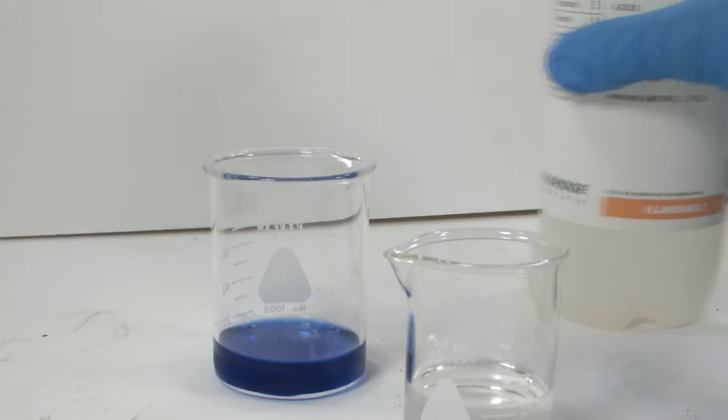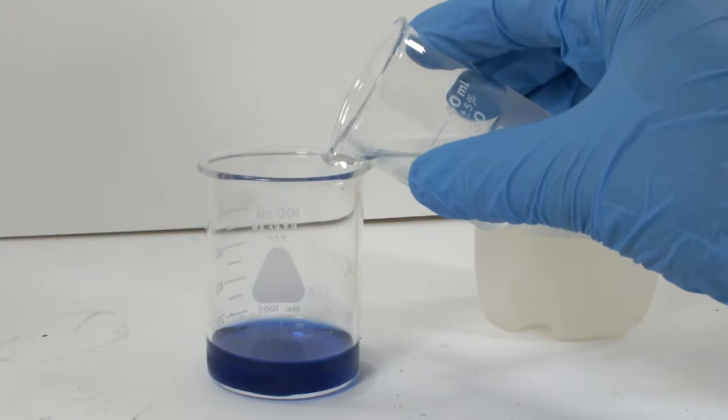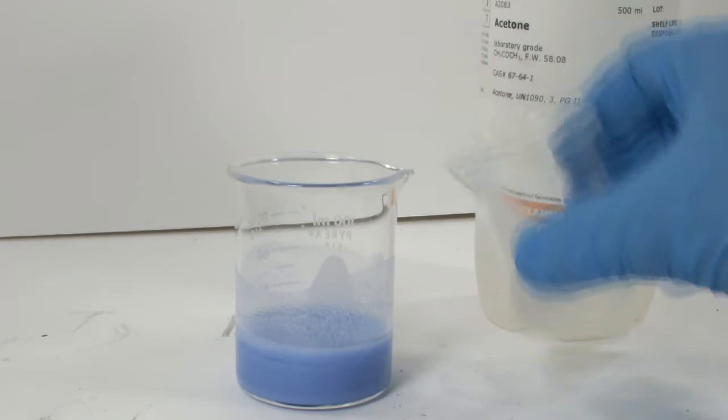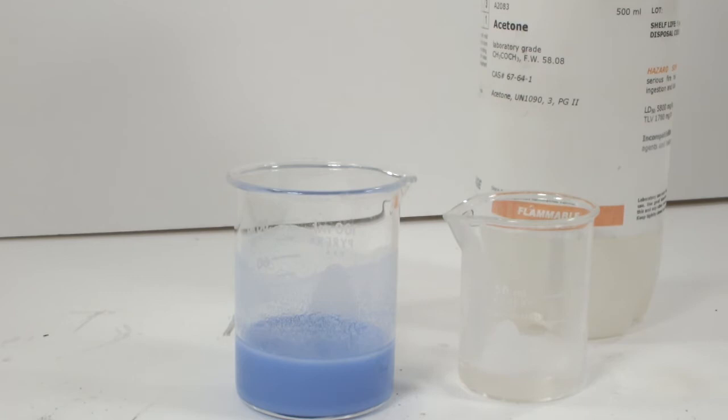This bottle of acetone is just out of the freezer, and the dark blue solution has been in the refrigerator for a while. Hopefully this will increase the yield of the complex. As soon as I add the acetone, you can see the formation of a light blue precipitate. I'm going to keep adding acetone until I can do so without seeing any more precipitate form. Then it's going to go back in the fridge.